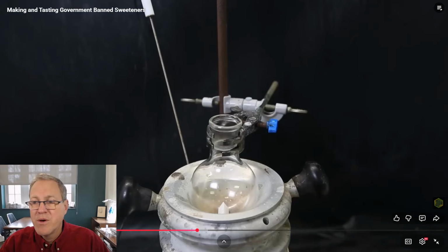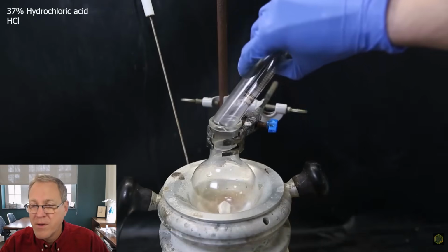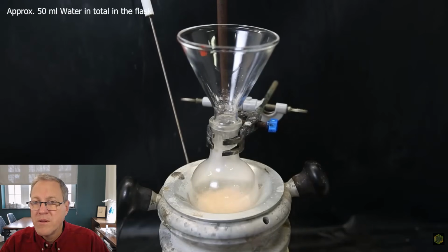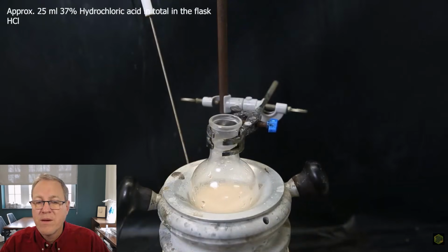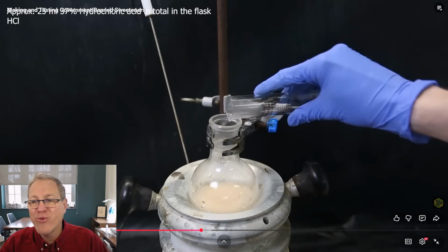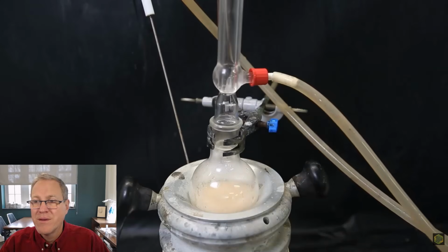So I set up a flask with a stir bar in a heating mantle and add some water and concentrated hydrochloric acid. I then add all of the wet product and wash it down with some water. In total, I have added about 50 ml of water. I then also add some more hydrochloric acid. Okay, a little bit of acid, bunch of water, and a little more acid. And now we're ready to go, and we're going to hydrolyze off this amide group. Which totals about 25 ml. I then attach a condenser, heat it to a boil, and leave it to reflux overnight.